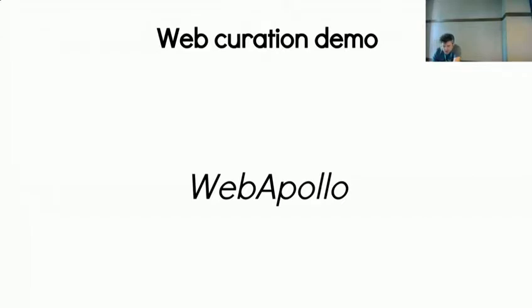Volvox is not a very interesting sequence since it's not real. The other thing I would point out is the ability to add additional attributes to a current annotation, to individual transcripts. This is a horrible interface. Let's add another one, there we go. So anyway, you can add multiple isoforms and so forth.